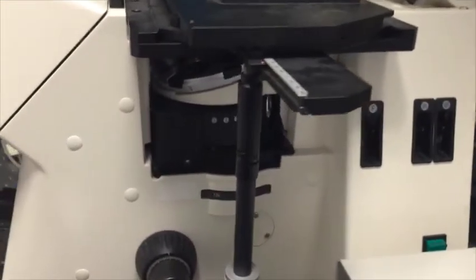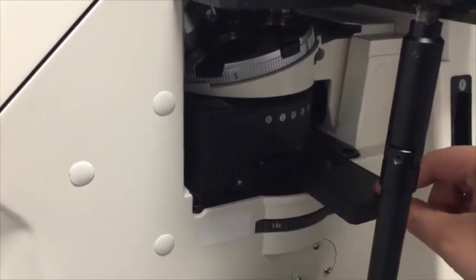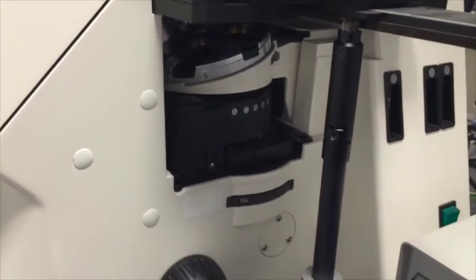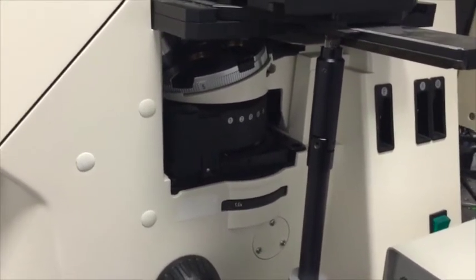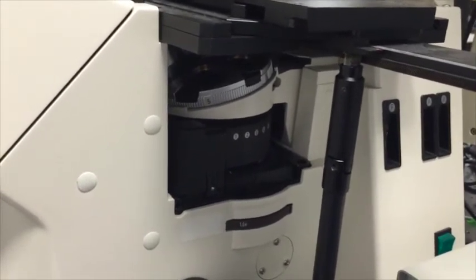The light goes through mirrors and then goes onto a polarizer. This is where we put a polarizer. You can tune different angles of the polarizer, or you can remove it so the incident light is unpolarized. The light then goes through a rotating aperture controller where you can choose between bright field and dark field. Now we are looking at a dark field where we put a light stop on it. And if you tune it, it can be bright field.